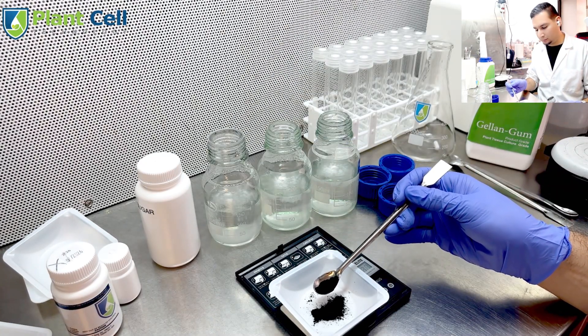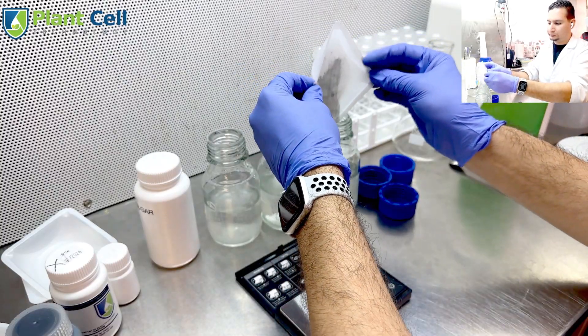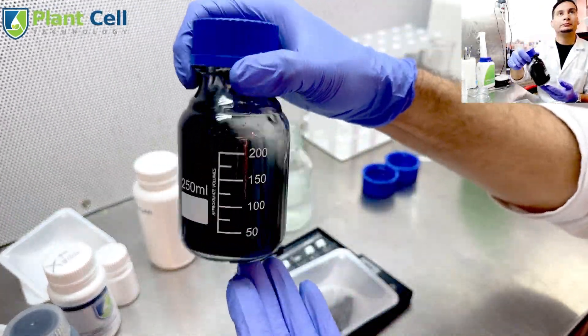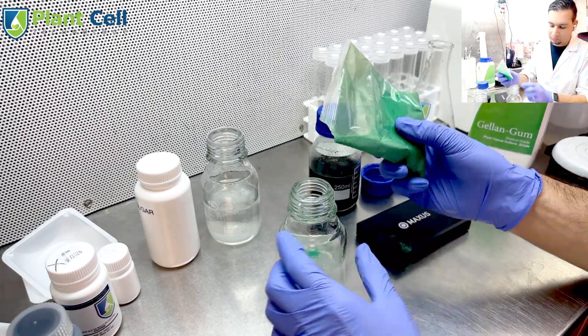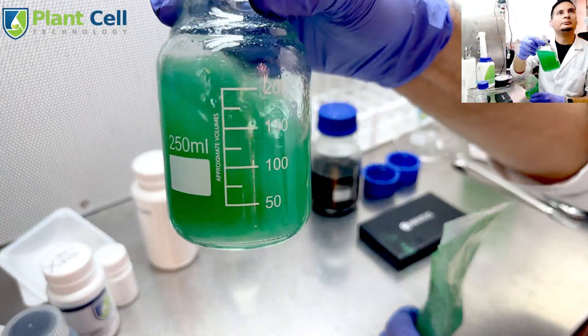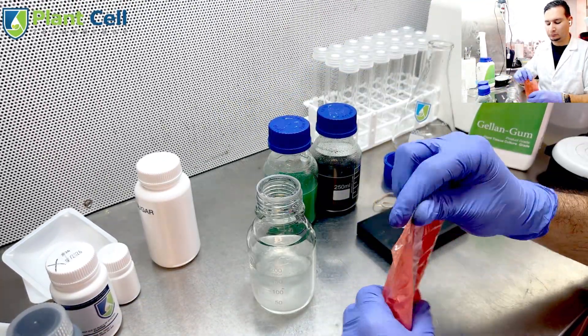This is kind of where it gets a little funny. I want to add charcoal to one of my jars because I want to make a little bit of a joke — if you've been naughty, you're getting plants with charcoal. The other two will be with full coloring, green and red obviously.